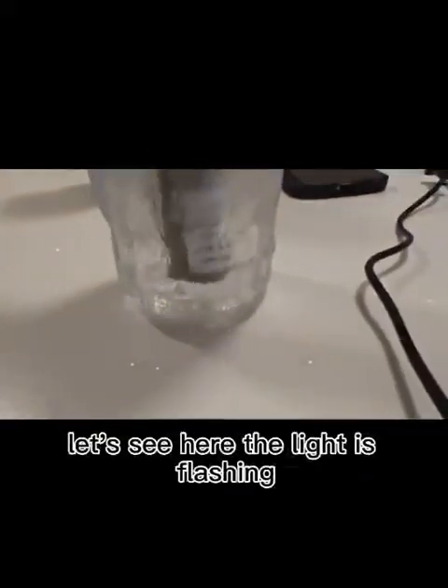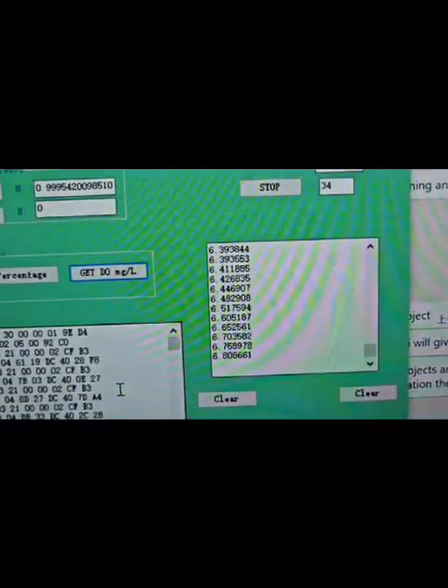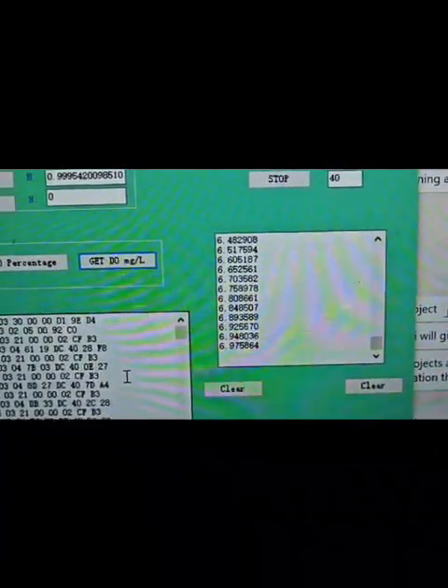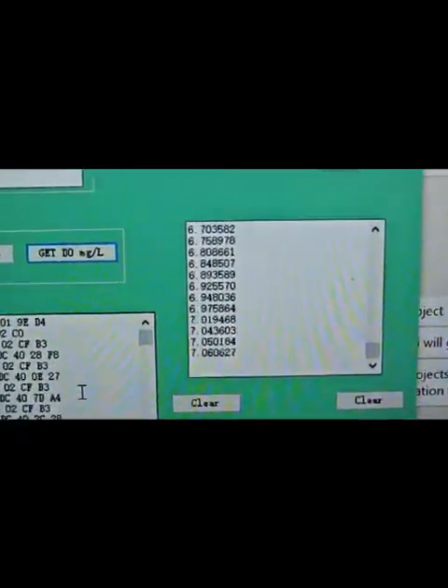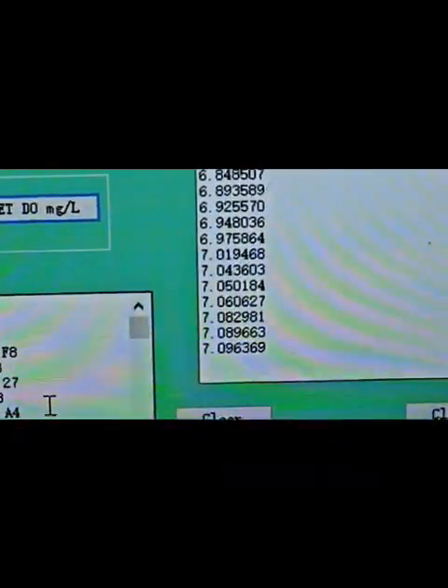Let's see here — the light is flashing. Let's see how the values change. It began to increase to 6.9. Now we come to 7.